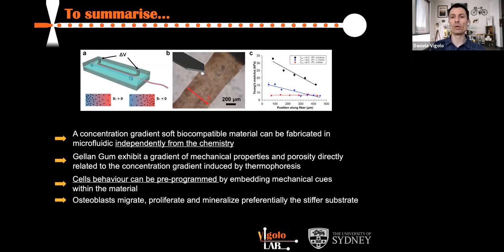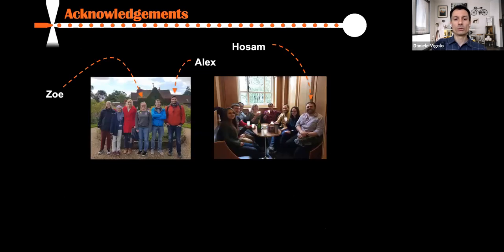In this particular case, we've noticed that osteoblasts, as expected, migrate towards the stiffer side, and they also mineralize in that direction as well. Now, before I conclude, I want to obviously acknowledge who actually did the work itself.